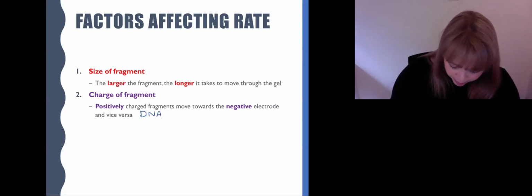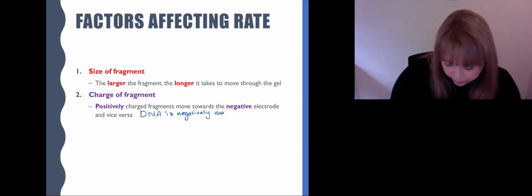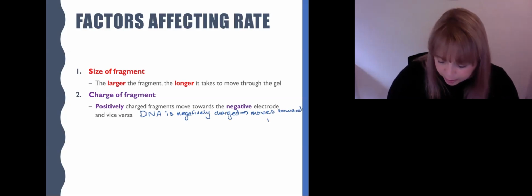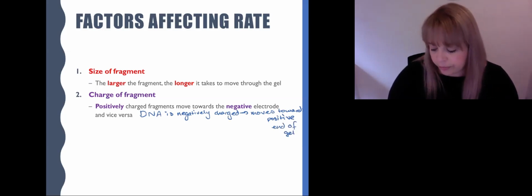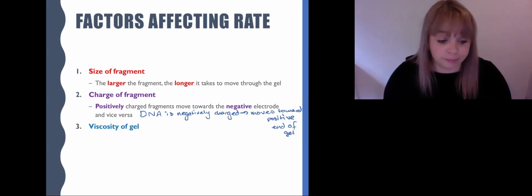DNA is negatively charged and it moves towards the positive end of the gel. So particles that are positively charged would be things like proteins.